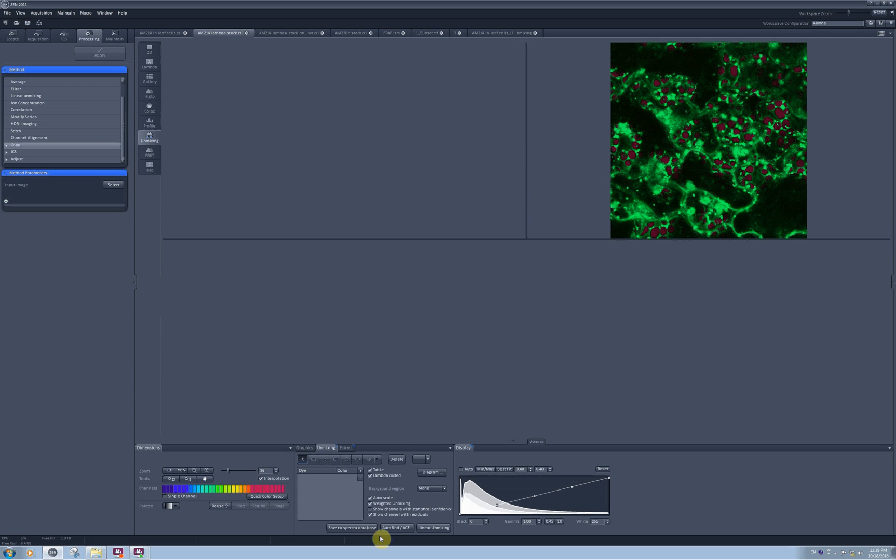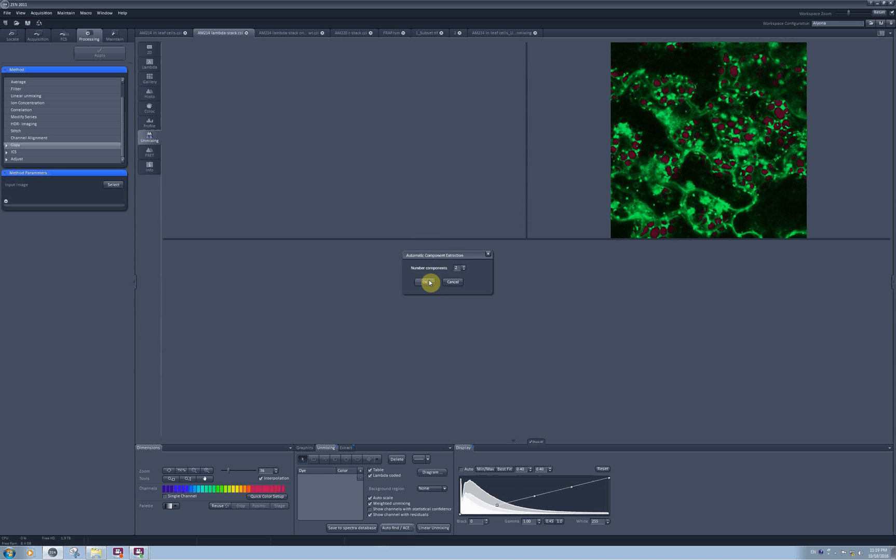And I can ask again the software to auto find the components on my image, and I have only two components: chlorophyll and YFP here.